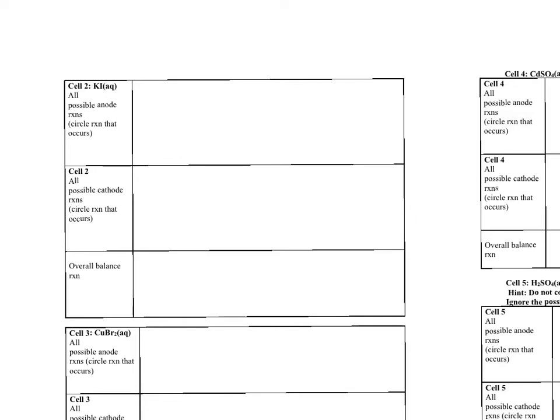In this lab video, I'm going to be talking about the electrochemistry experiment, part 2. As a reminder for part 2, we are looking at electrolytic cells, which are non-spontaneous. So if it's electrolytic, it's non-spontaneous. Non-spontaneous, E naught of the cell is negative. And that's why in the video you saw we were applying a voltage to make the reaction go.